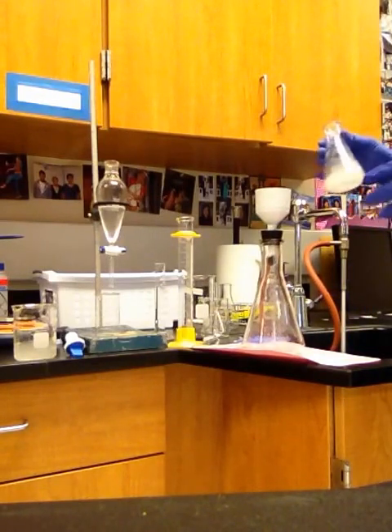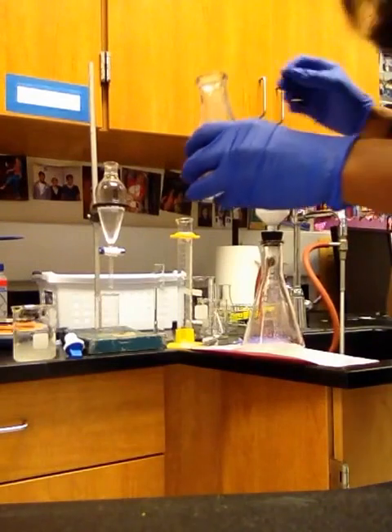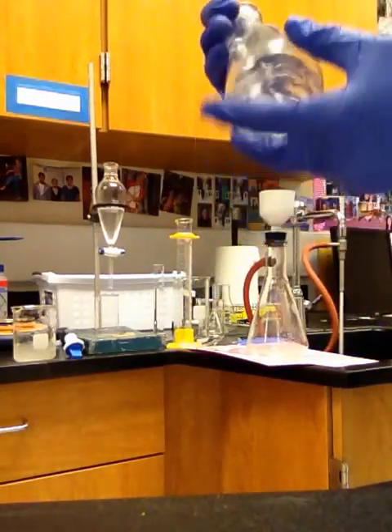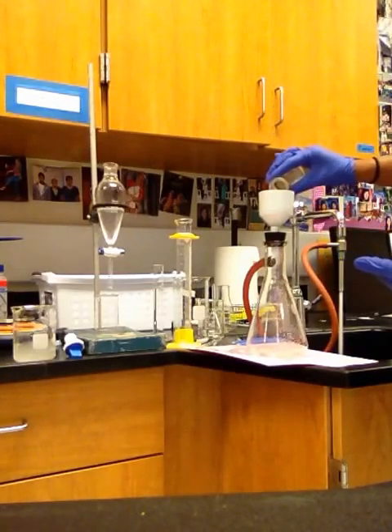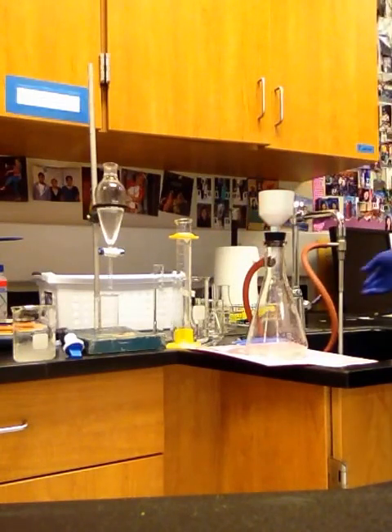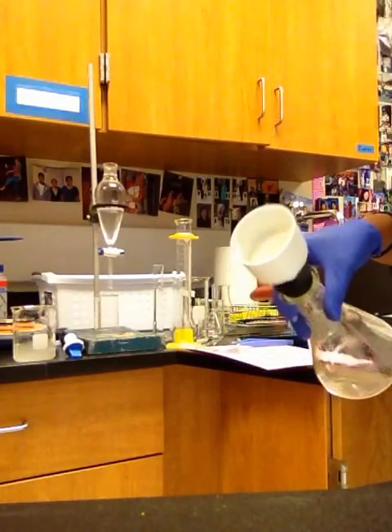and pour out all of the solution in there. If some residue is sticking there, you may want to use a tad bit more ethyl acetate, not a lot, but a little bit more, to take this residue out from here and pour it back in there. And as you can see, it is filtering pretty fast. What we have on the top of this funnel is the white residue of the binder.